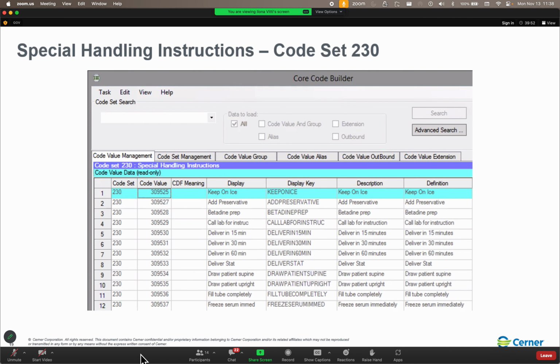And we would have 2, 3, 4, 2, 3, 3, 1, 7, 0, 0, 0, 6. So that's 1, 2, 3, 4, 5, 6, 7, 8, 9, 10, 11, 12. That's 12 characters. So with that max accession size of 12 characters, we would wind up truncating off the 1.